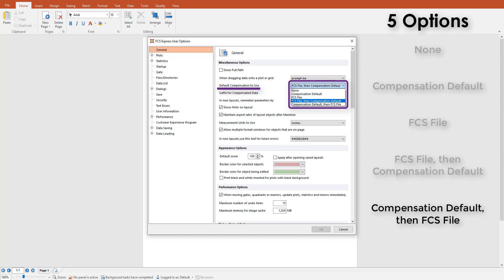The fifth option is compensation default, then FCS file. FCS Express looks for a compensation default within the layout. If there is not one to find, then the compensation from the metadata will be read and applied to plots.